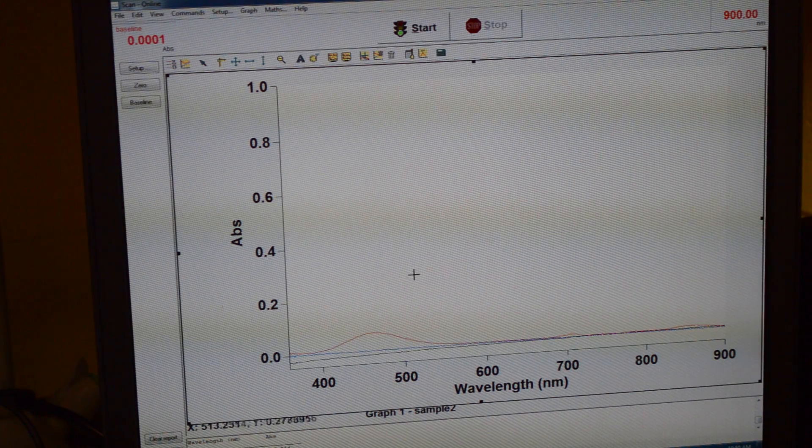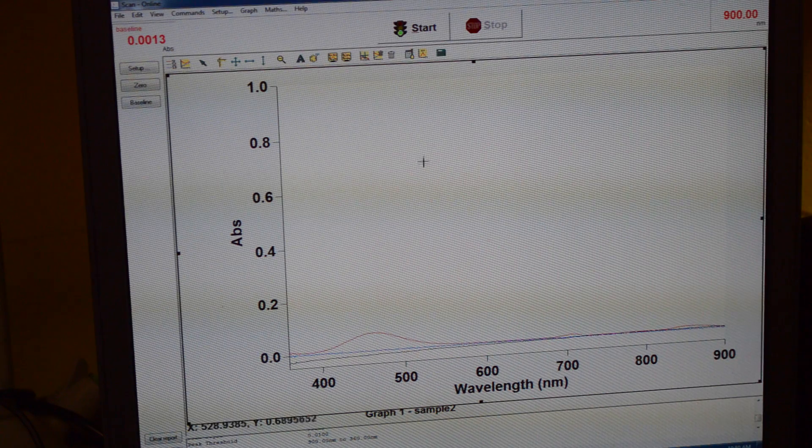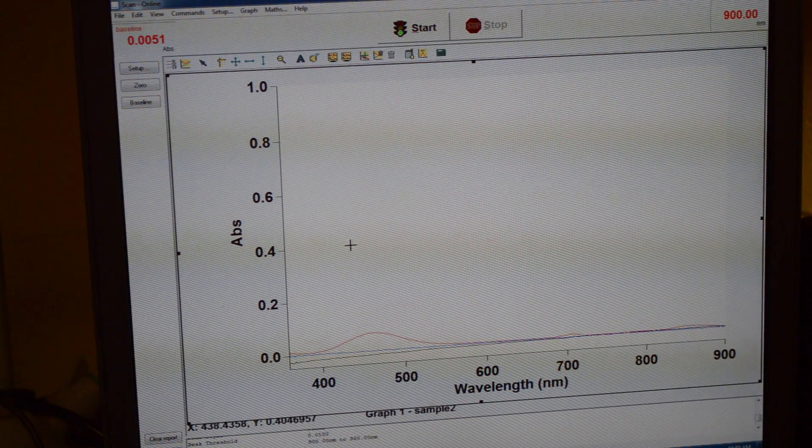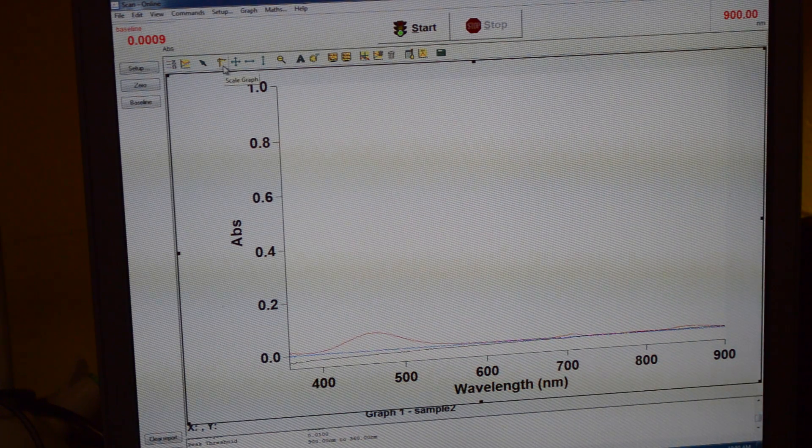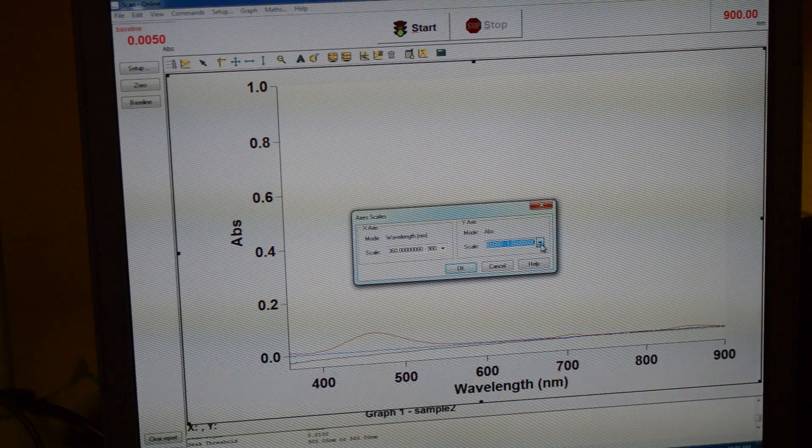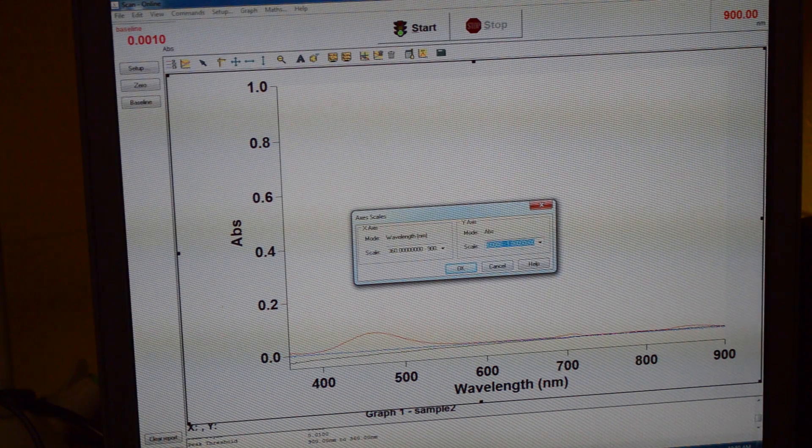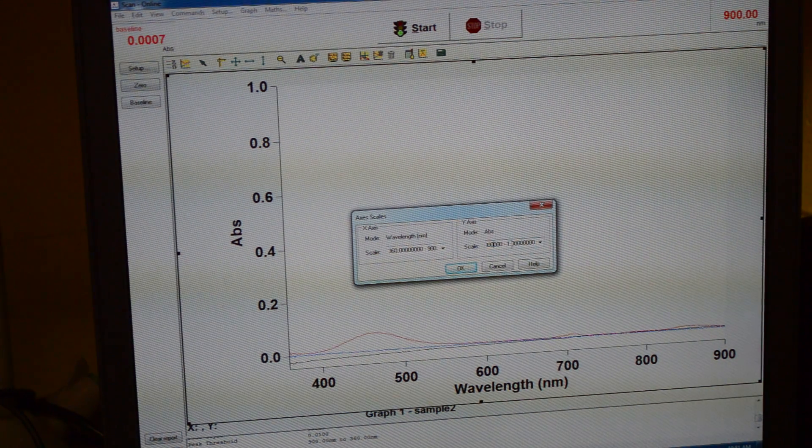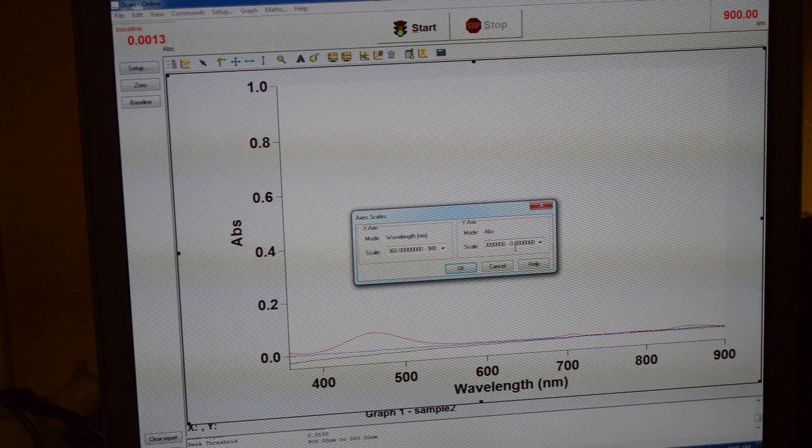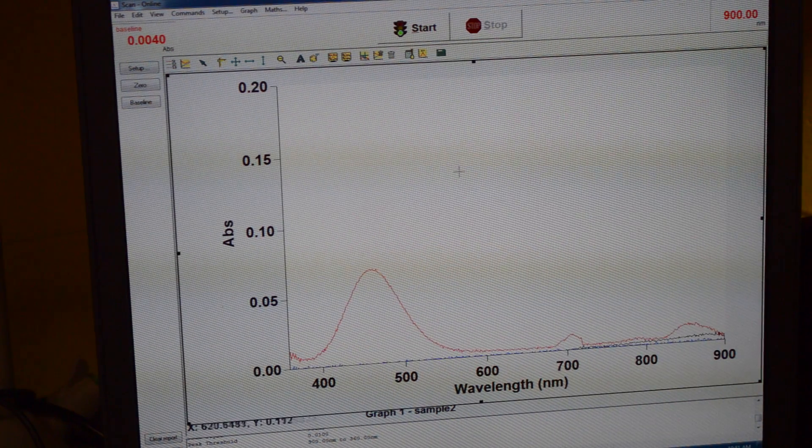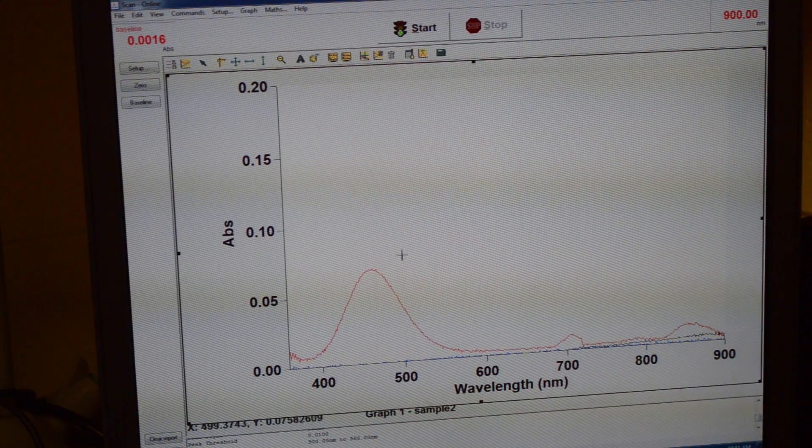Here we are going to modify the graph to pull out any results that we find important. To make the scale proper so you can see a nice curve in the graph, you are going to press the scale graph button up top here. You can set the scale depending on which part of the graph you would like to see. We can make our scale from 0 on the y axis to 0.2. As you can see, this made the graph bigger so we can see the results we want.